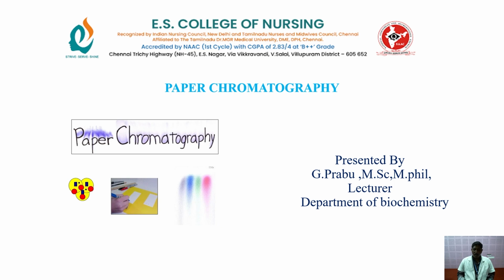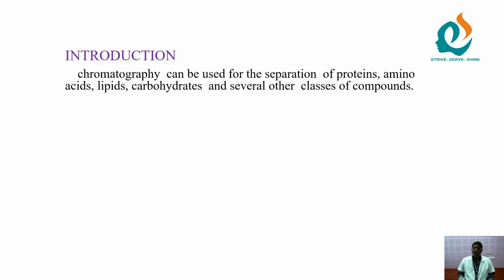Now I discuss the topic, paper chromatography. Chromo means color, graphy means separation.